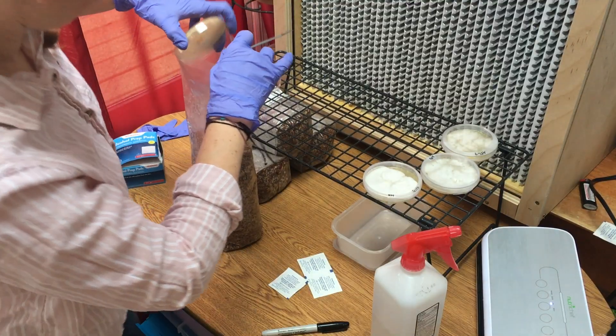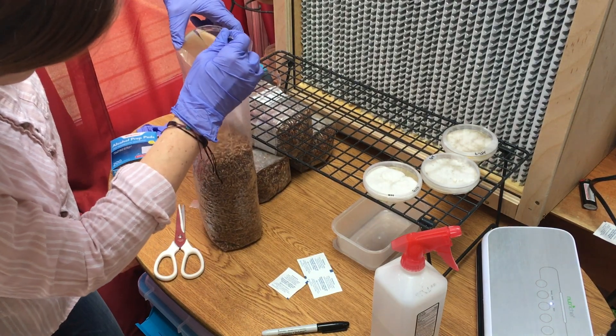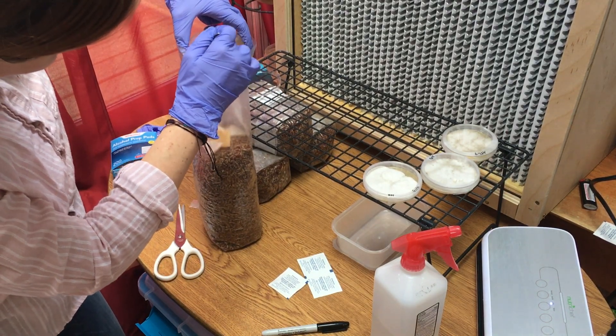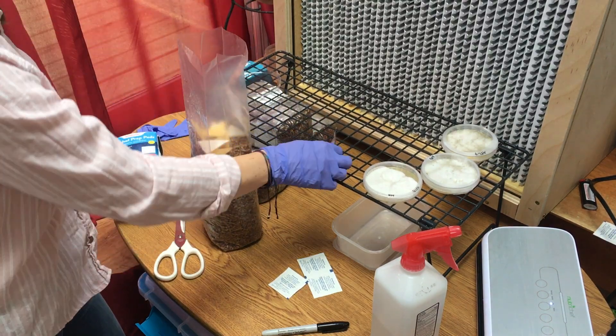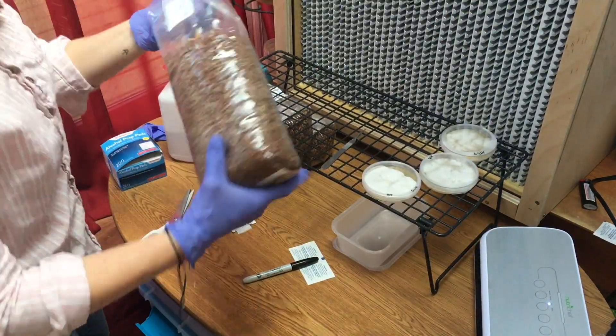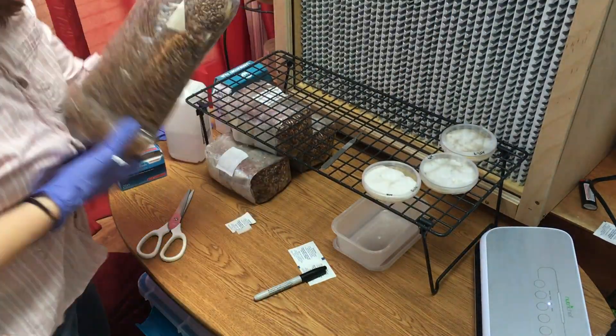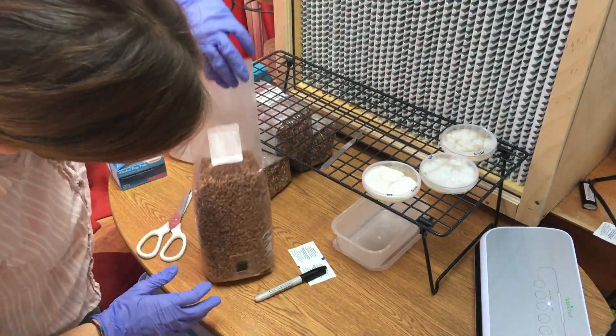Then, carefully transfer the agar to the spawn bag. Then, vacuum seal the bag. Finally, give the bag one last mix, thoroughly mixing the agar wedges within the grain, trying to cover all of the wedges.